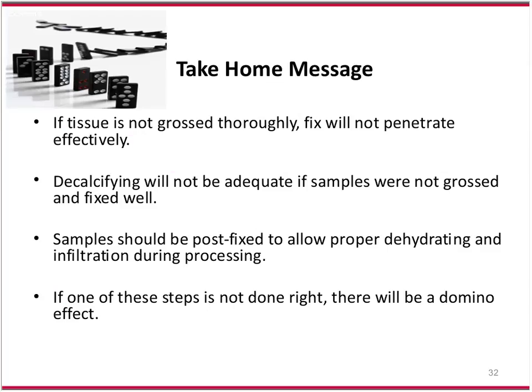If you leave skin on, say, mouse tail, because you've done something to the mouse tail and you're worried that if you fractured it, say, and you remove the skin on an early injury, it won't hold and maybe the callus will break, well, that's going to be a real bear to fix, decalcify, and, excuse me, it's going to be a whole bear to do anything with, especially when it comes to cutting if you've left the skin on.